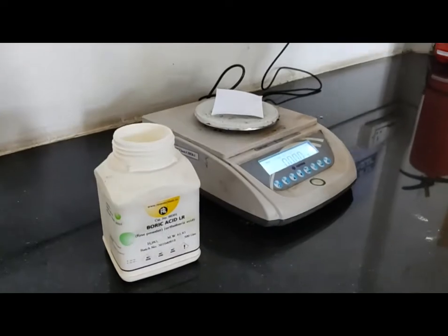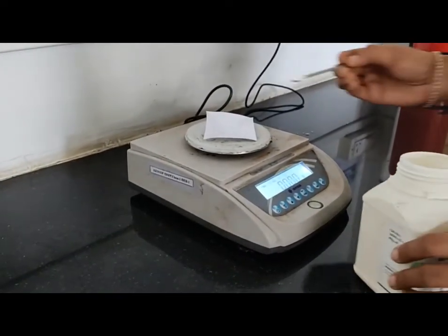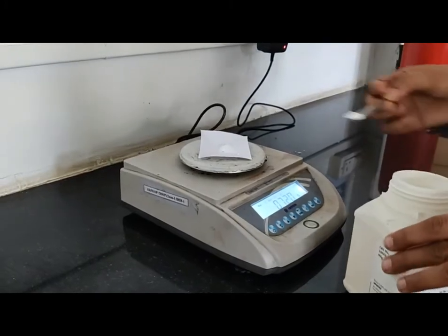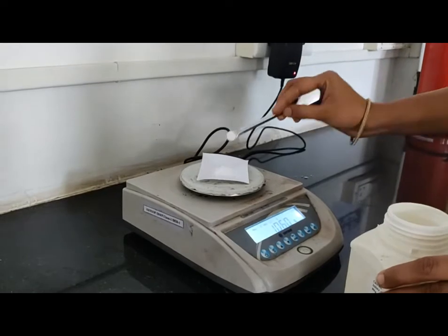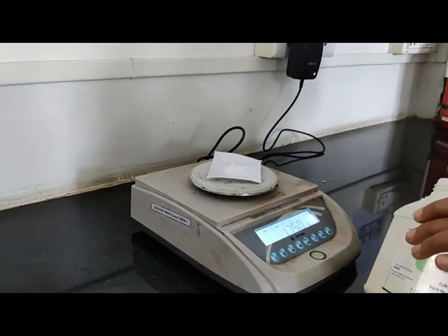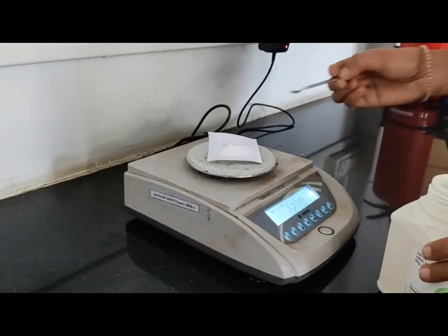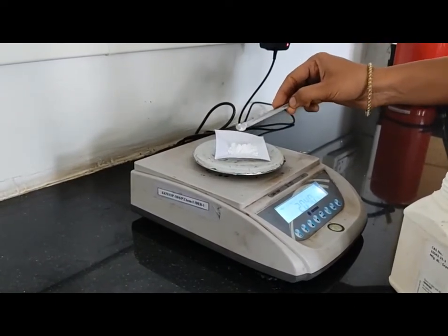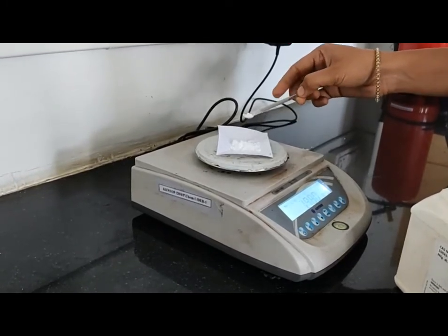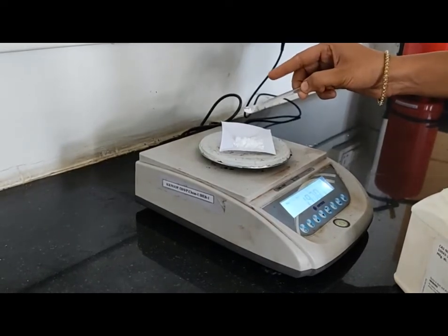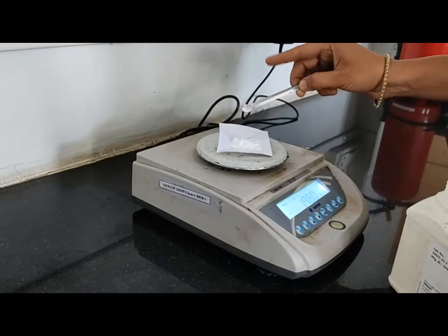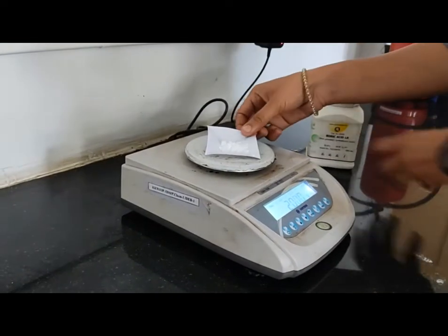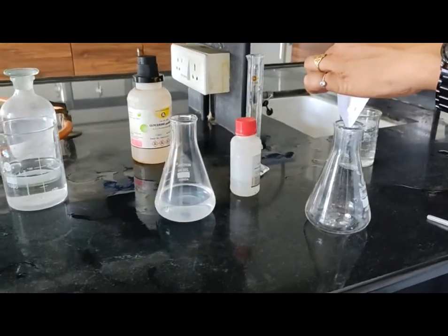Now let's start the assay. For that, we require 2 grams of boric acid. Add this 2 grams of boric acid into 250 ml conical flask.